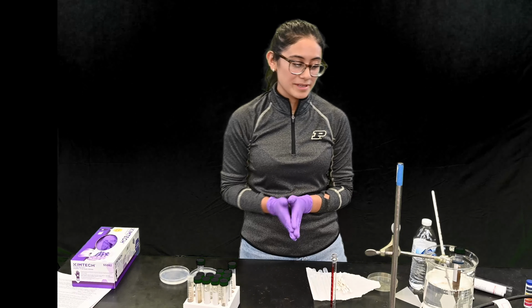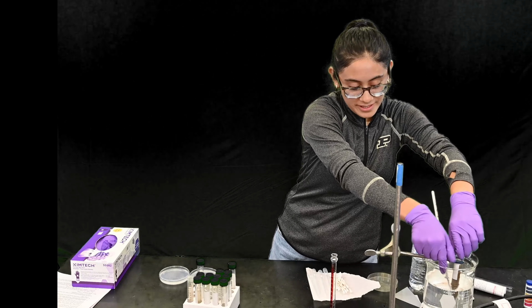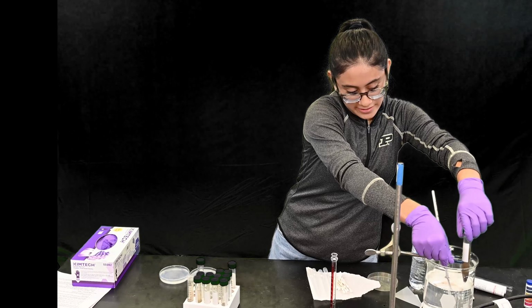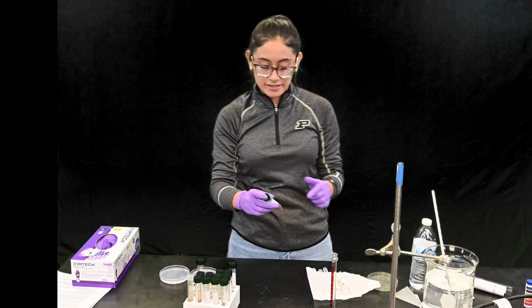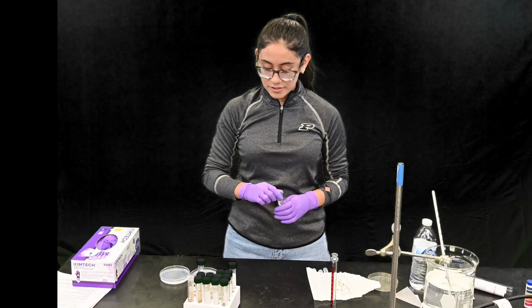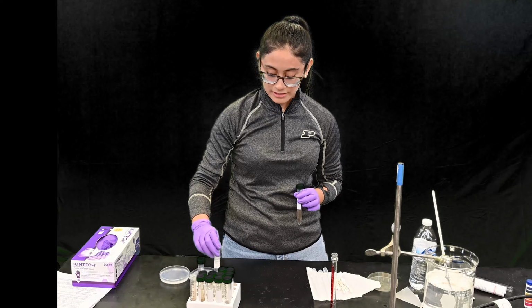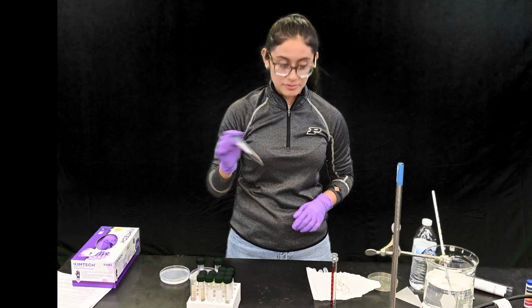Okay, so now we're going to begin with our dilutions. After your 30 minutes are up, you're going to remove your tube from the hot water and mix it. Then you are going to do two dilutions. Make sure to label your two test tubes, dilution 2 and 3, because this is your dilution 1.